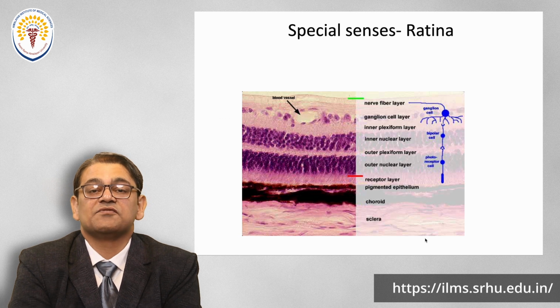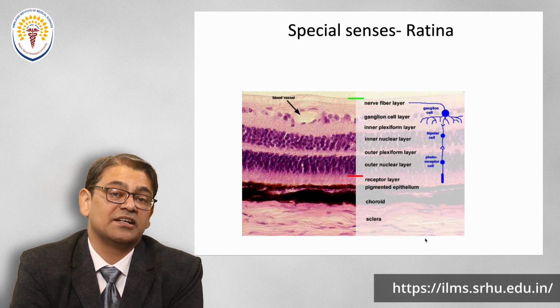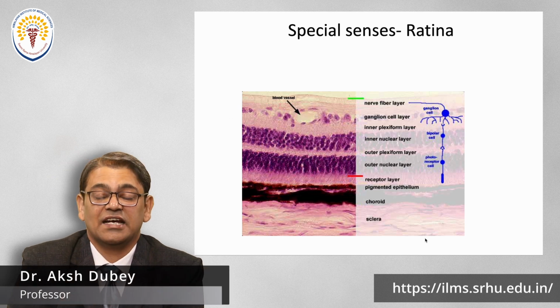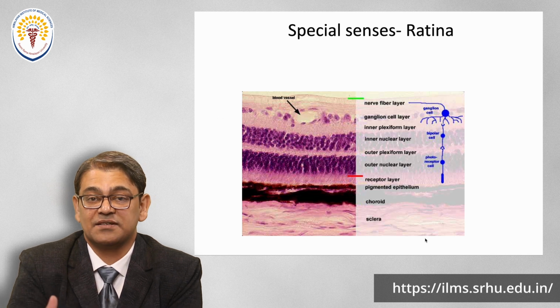Well, the retina slide is one of those slides that are very difficult to prepare in histology, because the retina usually gets broken and requires a very special technique. It is one of the finest state-of-the-art slides we need to make.